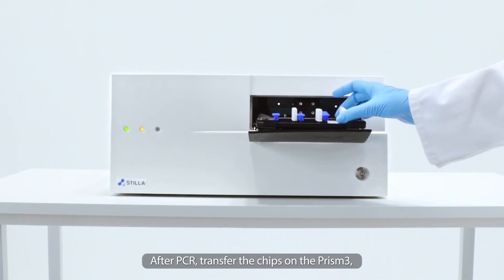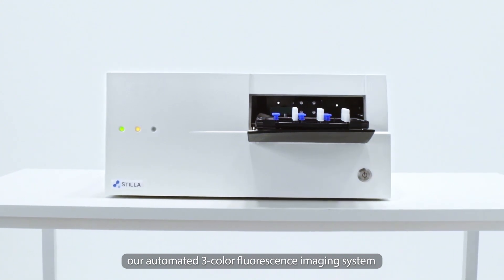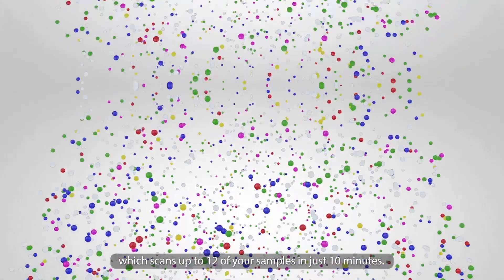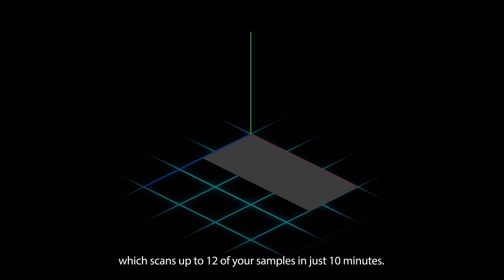After PCR, transfer the chips to the Prism3, our automated three-color fluorescence imaging system, which scans up to 12 of your samples in just 10 minutes.